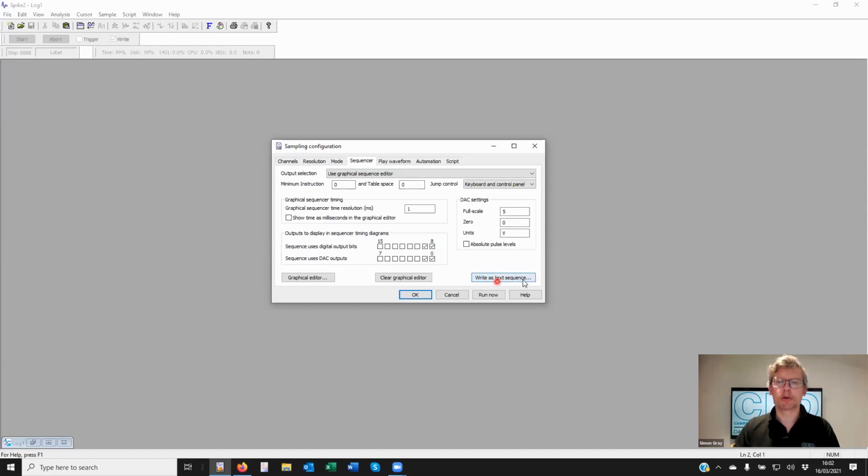Okay, so we'll have a look at the output in a little while. You shouldn't be concerned about this, the writing of the text sequencer, because that's all done for you in the background. And so the graphical sequencer, in effect, is loaded into the 1401 at runtime. Writing as text sequencer can often help you develop your own sequences. And that's sometimes required because of more critical timing issues you might face. But we'll discover those as we work through the graphical sequencer.